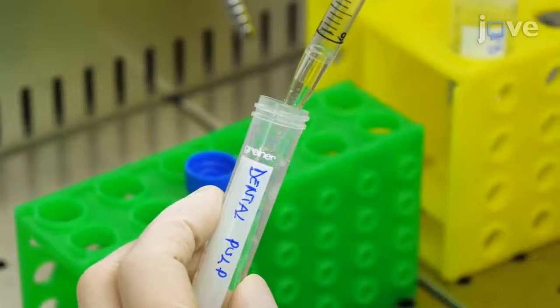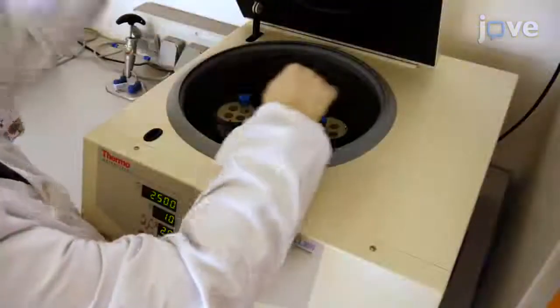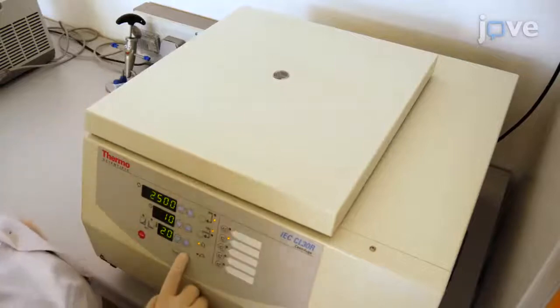Then wash with PBS three times and centrifuge at 2500 times G at room temperature for 10 minutes.